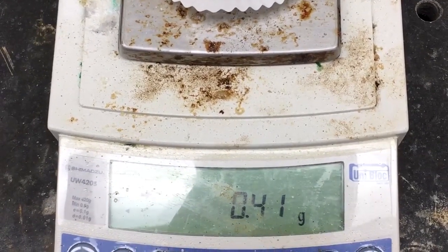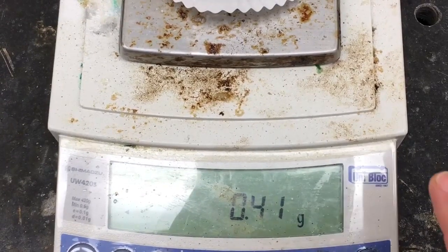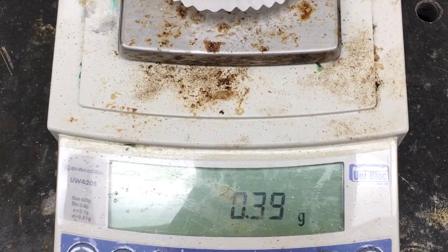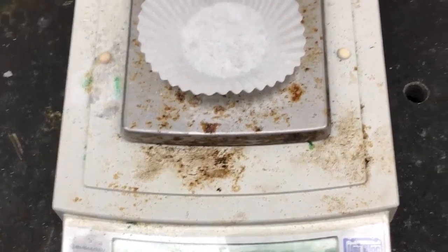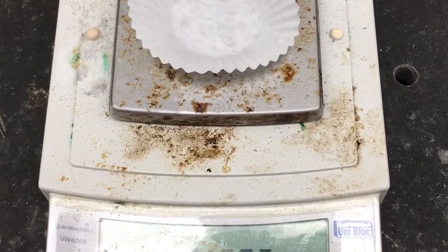One thing you just really need to know is that we're gonna tare this mass. So it has some sort of mass, well, we're gonna negate it. We're going to just set it to a new 0. And you might notice that the mass is fluctuating. Well, part of that is because these scales do fluctuate.